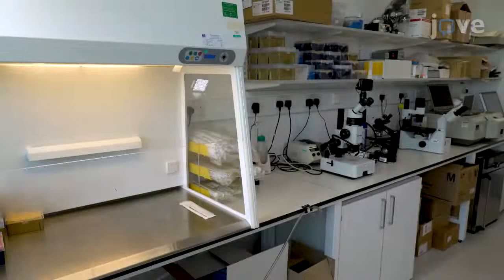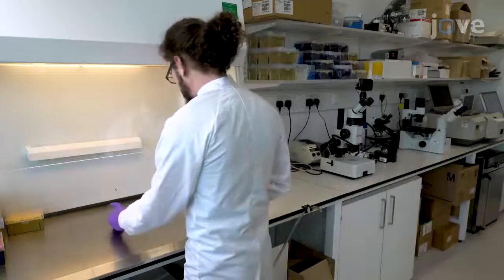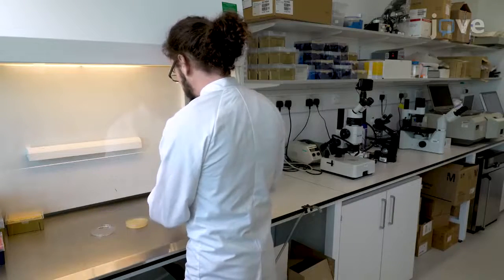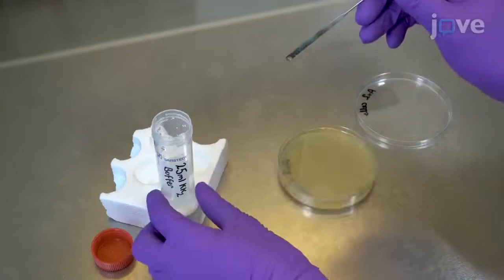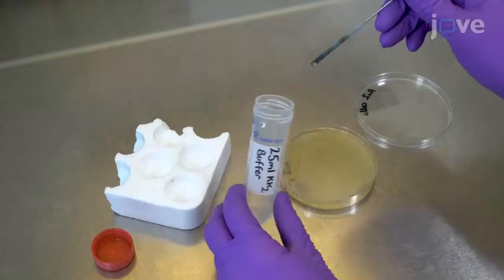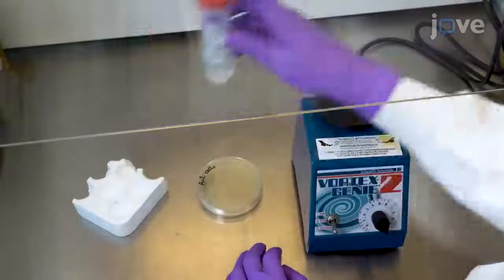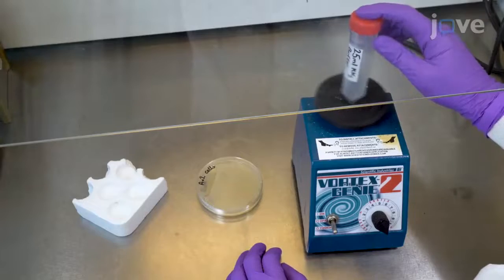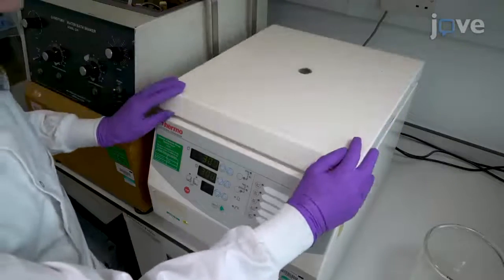To begin this procedure, obtain cultivated cells on SM agar with bacteria as outlined in the text protocol. Harvest cells from the feeding front into 25 milliliters of KK2 buffer in a 50 milliliter centrifuge tube. Vortex the tube to dissociate the cells. And centrifuge at 300 G for 3 minutes.